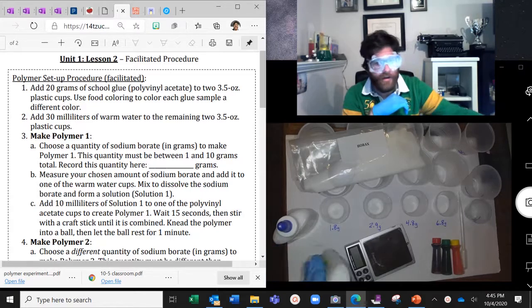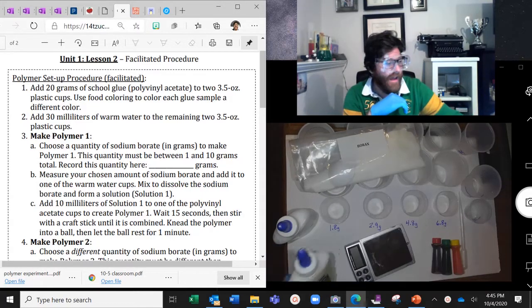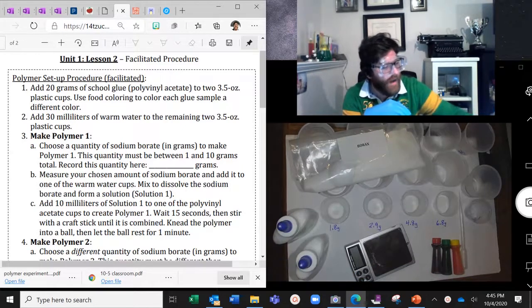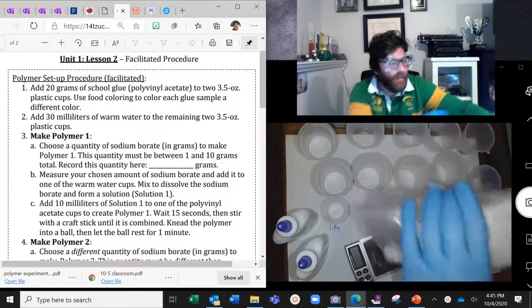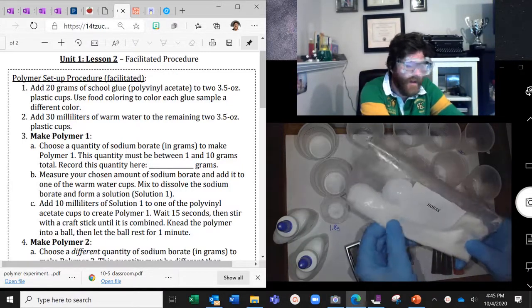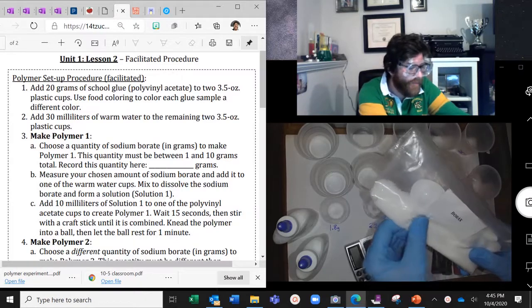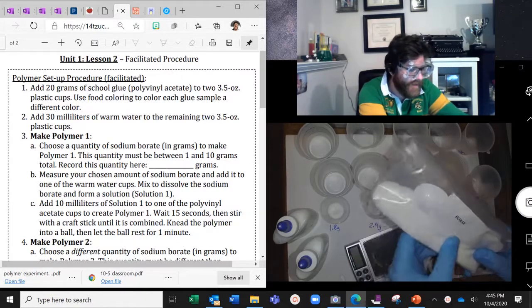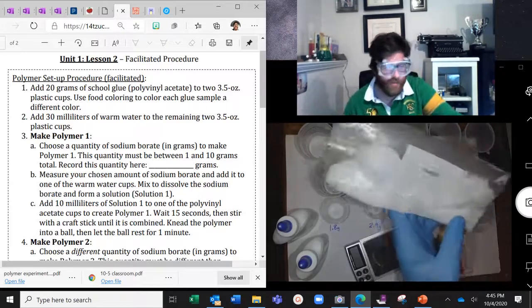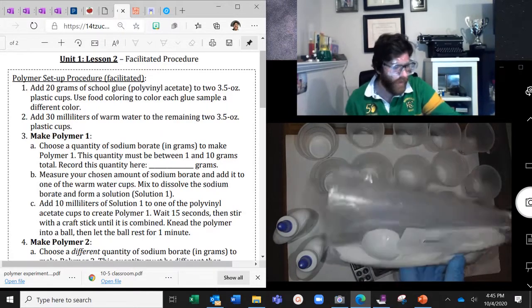So remember, we got white glue, polyvinyl acetate. This is our polymer starting material, like our spaghetti on the plate for our chains in the box. And we got some borax, or sodium borate. You can see it's not a polymer. It is a salt, sort of crystalline structure, white. And we're going to actually mix this with water before we add them together.